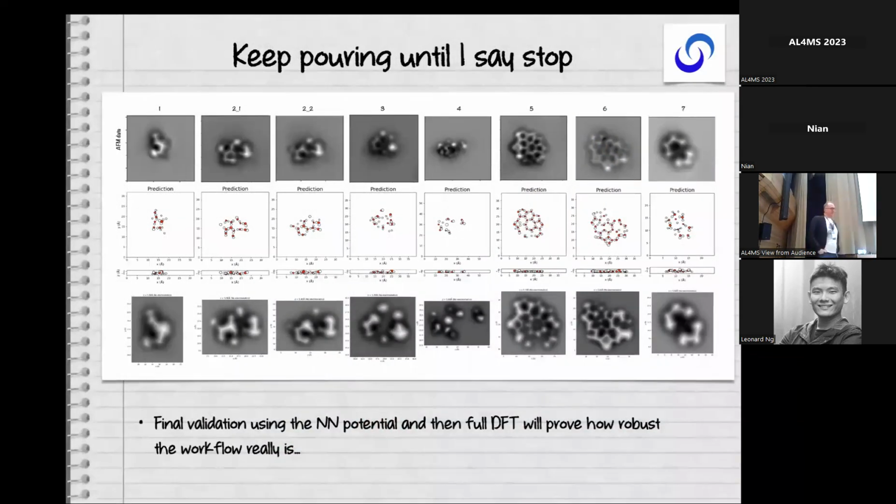And this is a big slide, but the idea here in the top is a sequence of seven or even 8 experimental examples, the experimental data. And this is one snapshot from a range of experimental data. And already in general, as an expert, maybe 1 or 2 of these you could guess by eye where the water is, but we just feed this into the new model. It makes a prediction of what the water structure is, and then we can calculate the simulated AFM image, and generally this is in very good agreement.